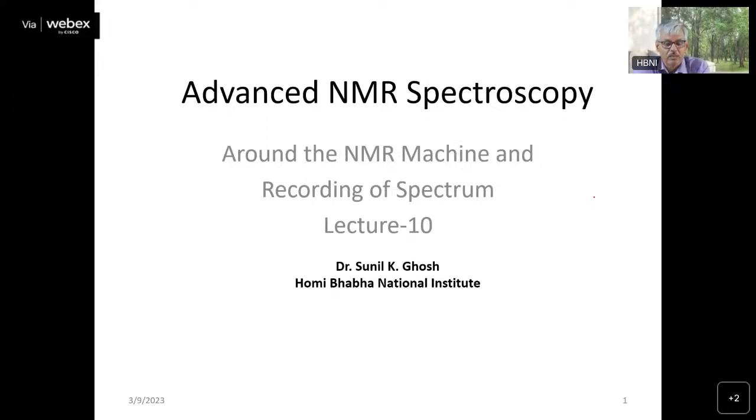So today I'll start talking about the NMR machine and how to record an NMR spectrum in an NMR machine. This part will be very useful when you go for learning 2D NMR and beyond that.